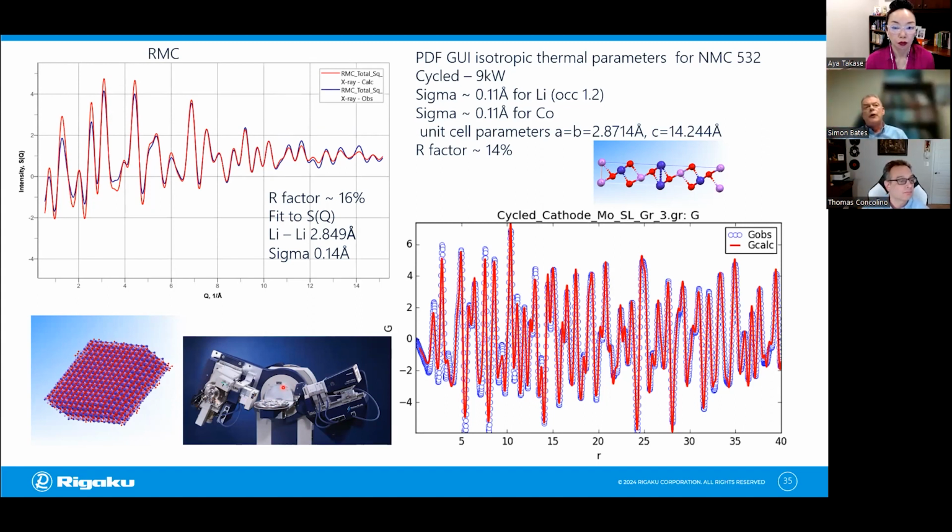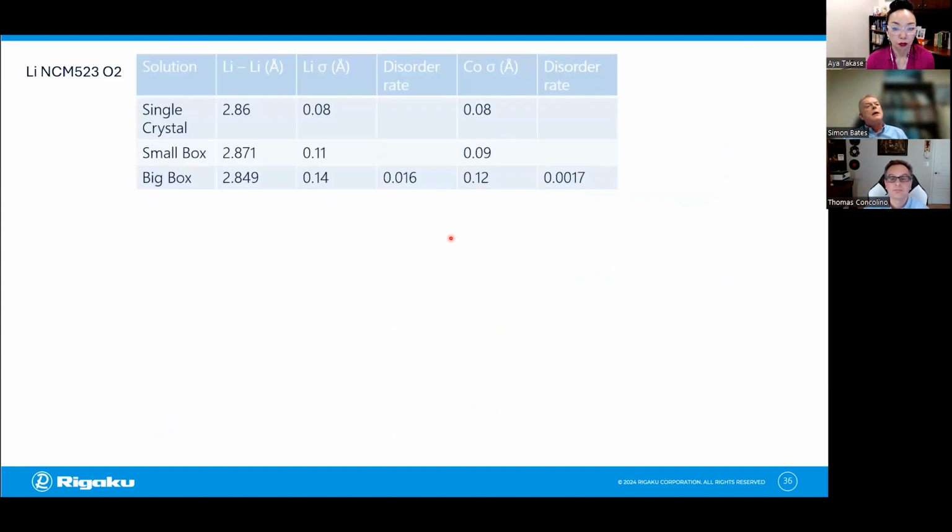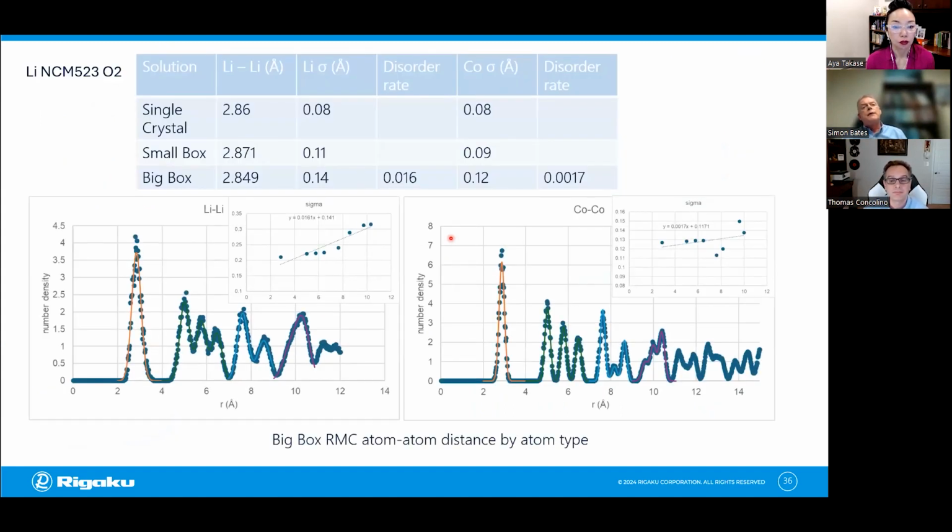The software has been automated to handle all of that. And in the final table, we'll compare those factors together. So this is the data from the powder diffraction system. Again, there's really no surprises here. This follows pretty much the same trend that we've been seeing all the way through.